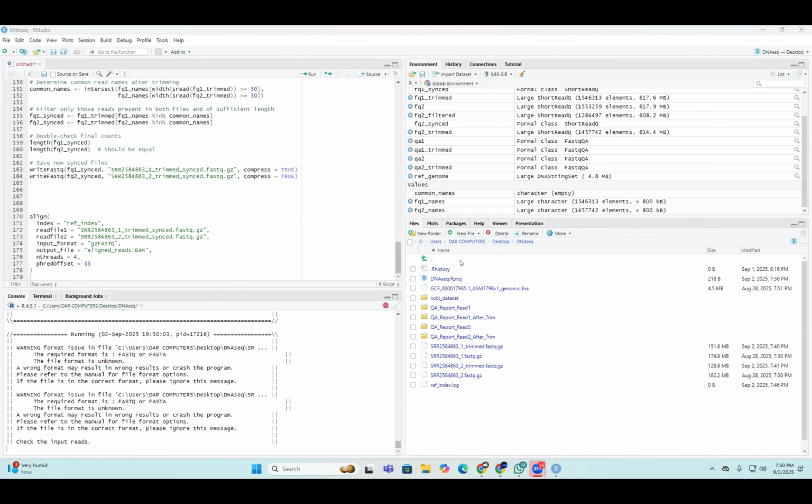Sanul Islam, I need to check your screen to debug this issue. While it's working and showing me the red dot, please share your screen.